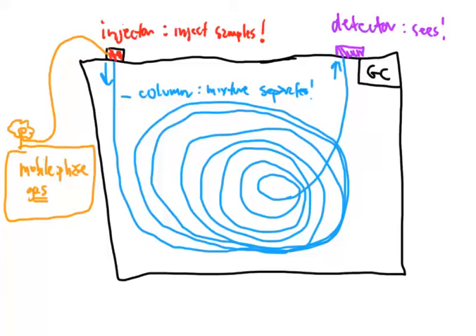It's a few pieces that are hooked together that need a little bit of flow and extra help from some gas, and then this thing can detect very volatile compounds with low boiling points and low molecular weights that could be pharmaceutical hazards or environmental hazards or health hazards, you name it. But that's the purpose of the GC, and that's how it begins to work.